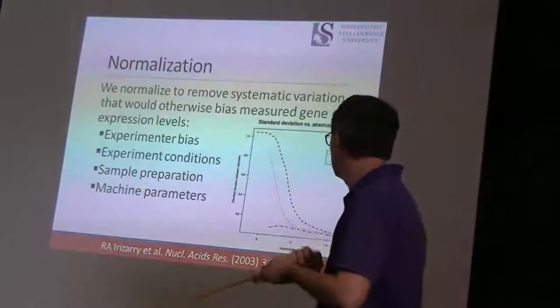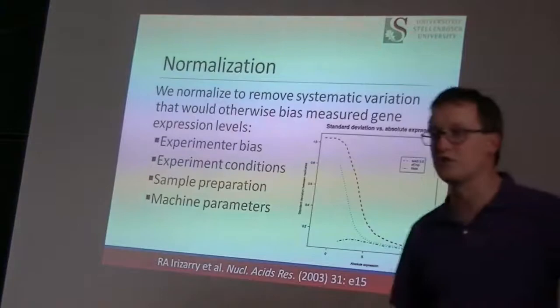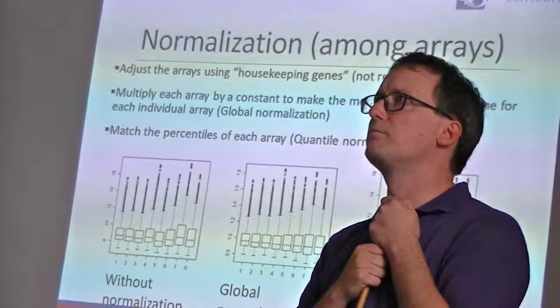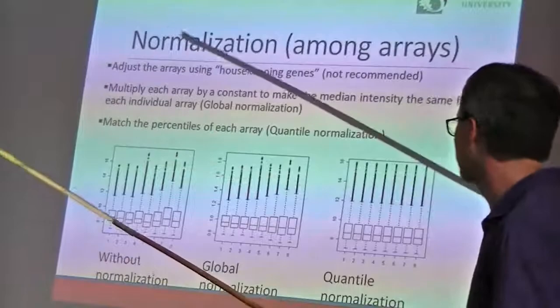So here we see a comparison for Mas5, DCHIP, and RMA. These are 3 methods that have been put forward for normalization. And we see that RMA gives one of the most robust reductions in standard deviation for this method. We also spent a little time this morning looking at the box plots showing the microarray intensities across these samples. And we saw some amount of raggedness there. They didn't all have quartiles that matched up equally well across the cohorts. So being able to do normalization is valuable.